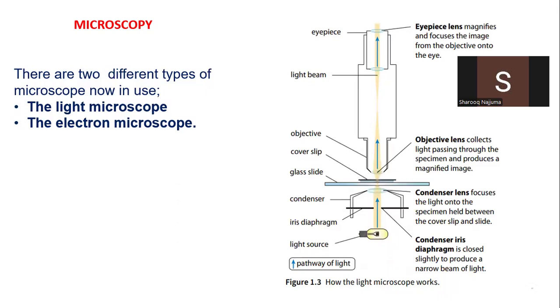Okay, so remember that when you're to observe an object under a light microscope, the light microscope uses light as a source of radiation. Radiation is the type of energy that type of microscope is going to be using. So the light microscope uses light energy. And how does this microscope work? We are going to have a section where the specimen is placed. Usually there is a stage where you place the slide that has the specimen, and light is supposed to pass through that specimen.